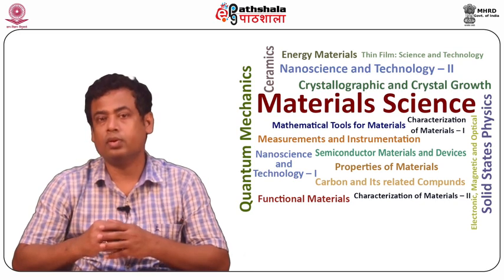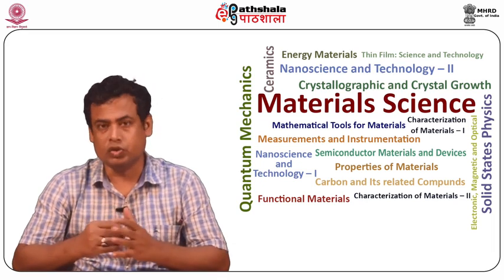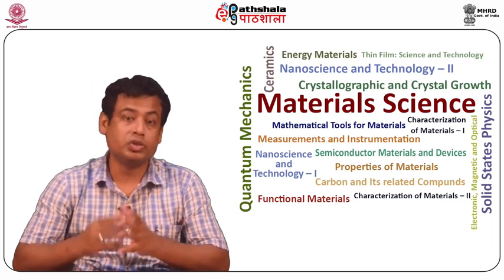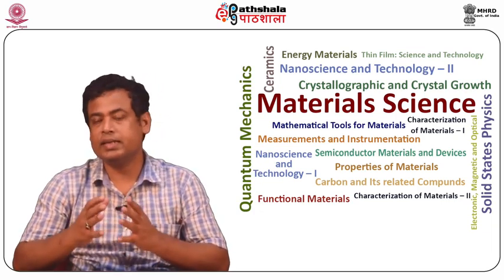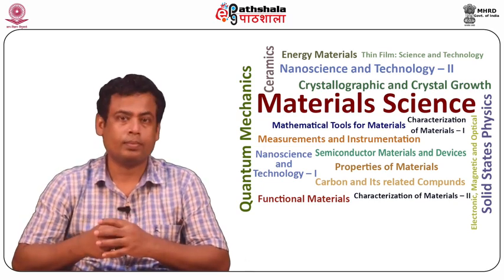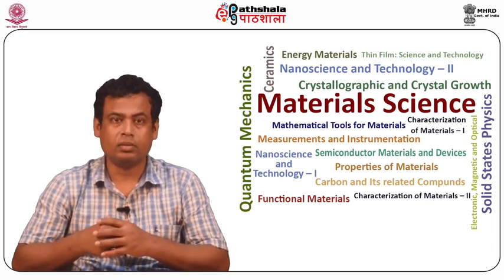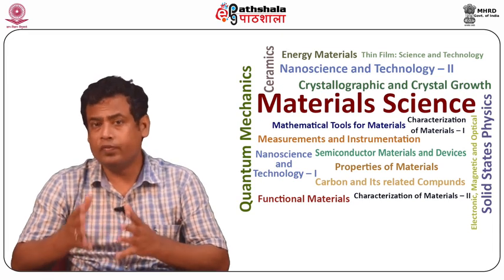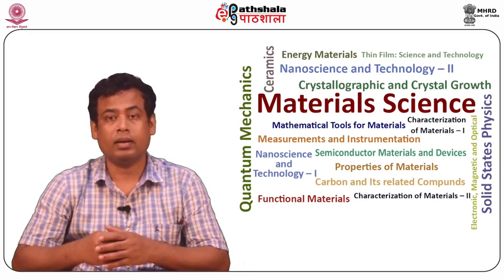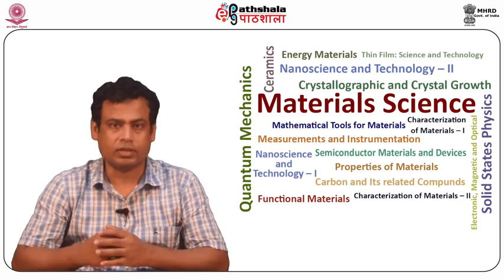Each energy width epsilon of a channel I in the multi-channel analyzer corresponds to backscattering events recorded in channel I of thickness tau I. The number of counts Hi in channel I is dependent on two factors: the thickness of the slab and the number of scattering centers in that cross section.